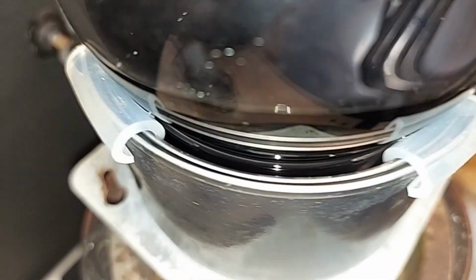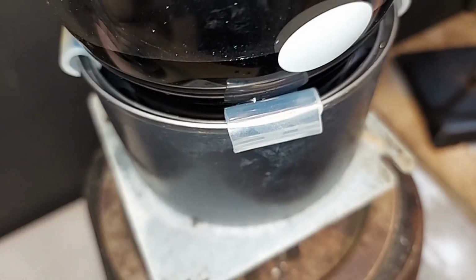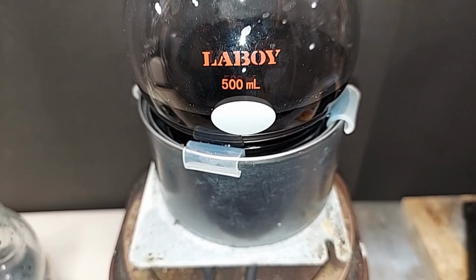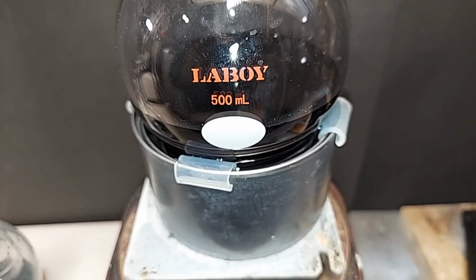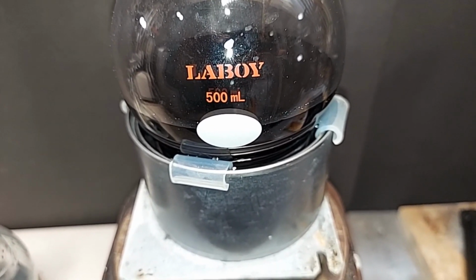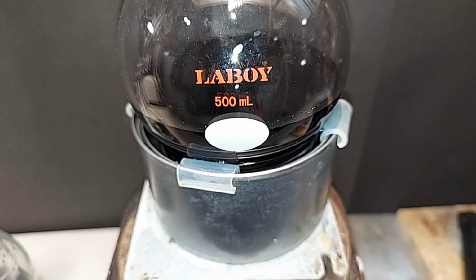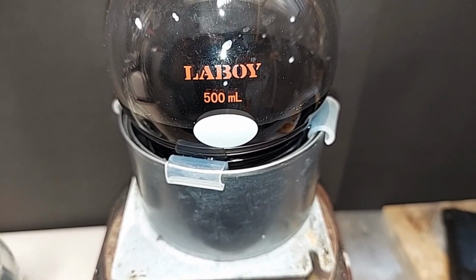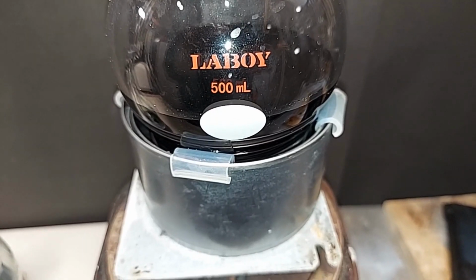Also of note is that there's oil in there. That's not water, of course. And because this is a relatively low heat situation, these silicone holders will be just fine. You can use vegetable oil in situations like this when you're dealing with lower heat, but mineral oil is preferred because it has a higher boiling temperature, and it also doesn't break down like cooking oil will after some time.